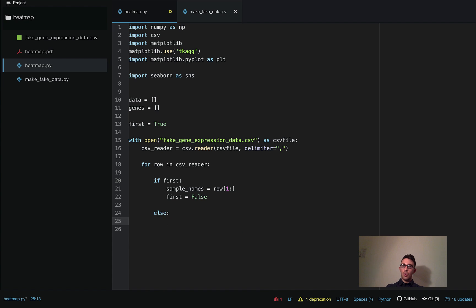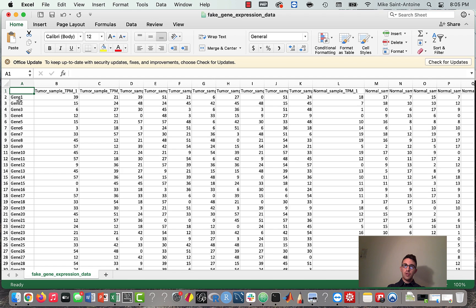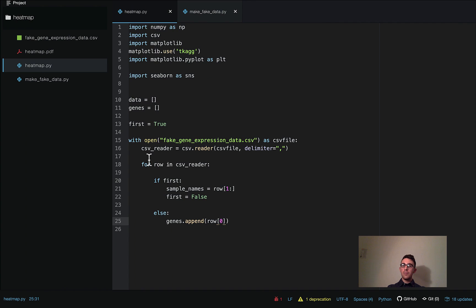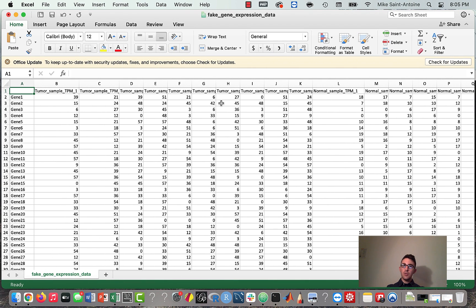In the else branch — if we're not at the first row — we append the first item in the row to our genes array, because that's the name of the gene. Then for data, we append all of the rest of the row from the second column onward to our data array — that's the actual transcription data.